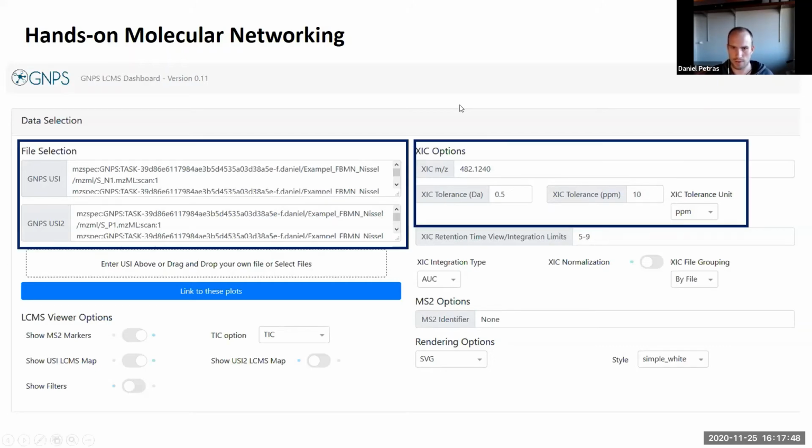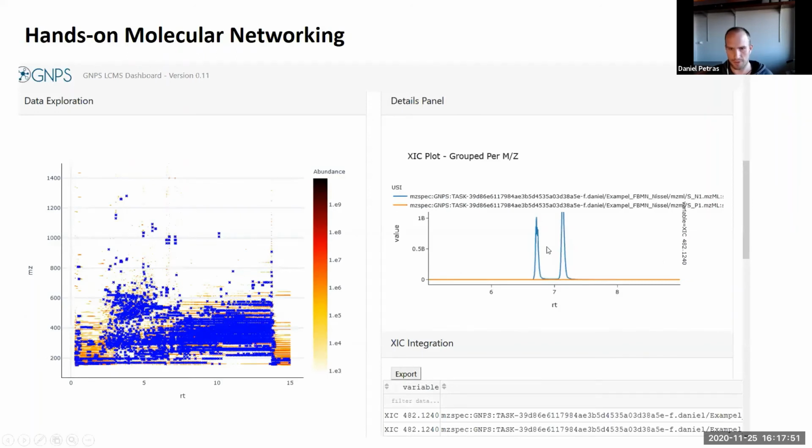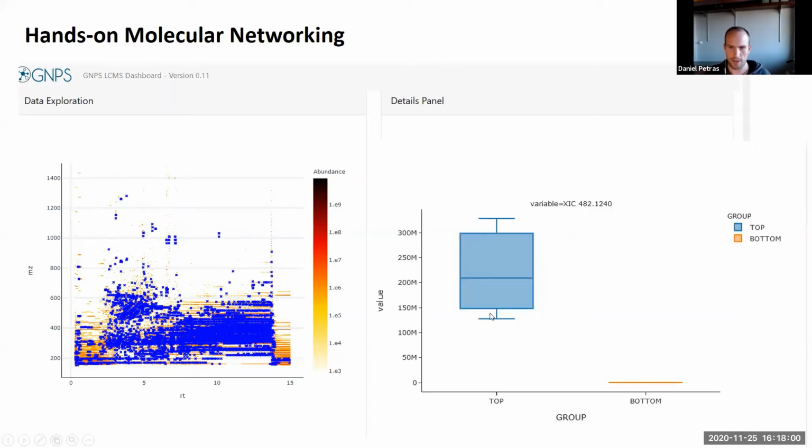Now, what we see here is the groups, and surprise, surprise, the orange one is our knockout. Then if we scroll farther down, we see that there is a clear difference in relative abundance. For the knockout it's obvious, but let's say we would play around with promoters, or with signaling, or a certain phenotype response. Of course, tinier differences could be really exciting, and then having a box and whisker plot is way more accurate than having spectral counts only in your pie chart.